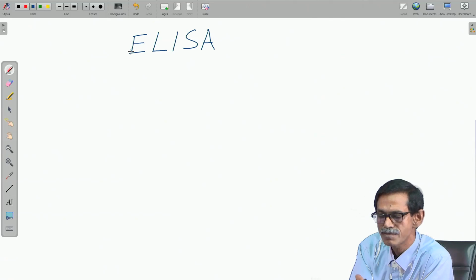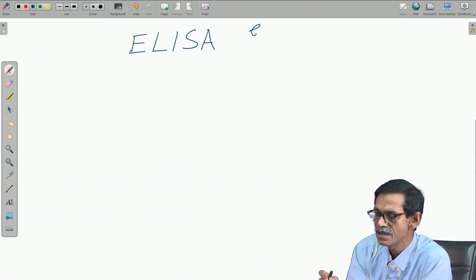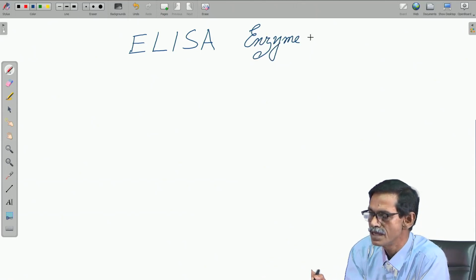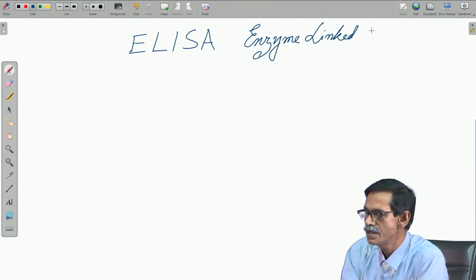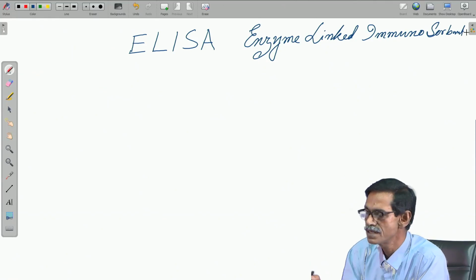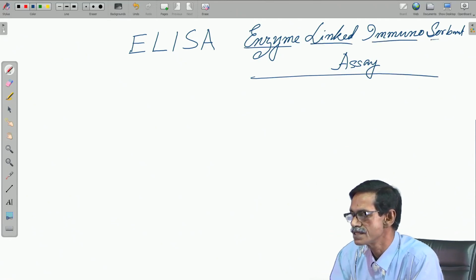ELISA stands for what? Many of you know, but still I am writing. It is enzyme linked immunosorbent assay. I purposefully wrote this S bigger. Enzyme linked immunosorbent assay.